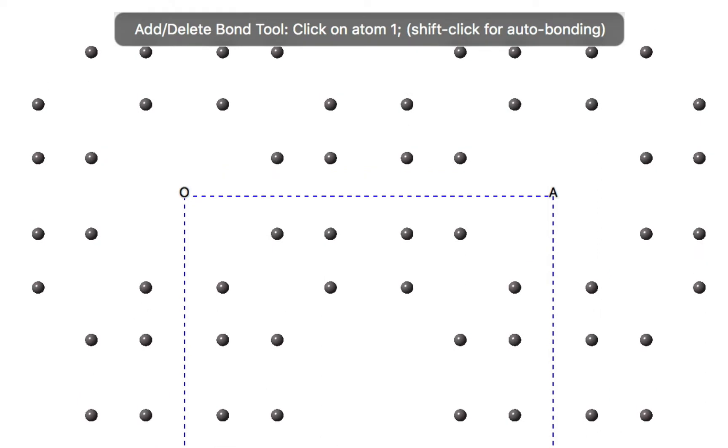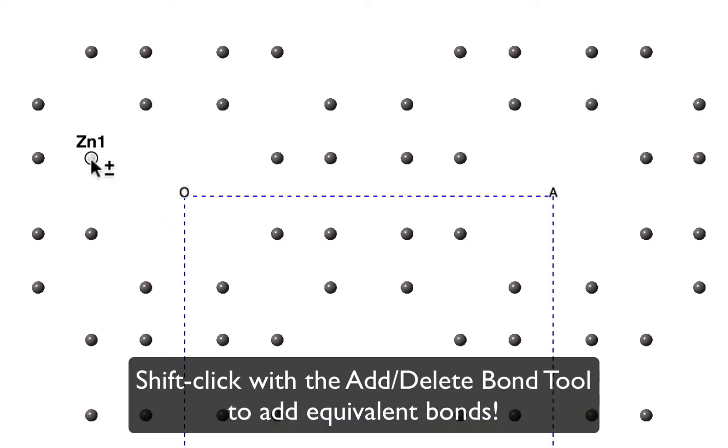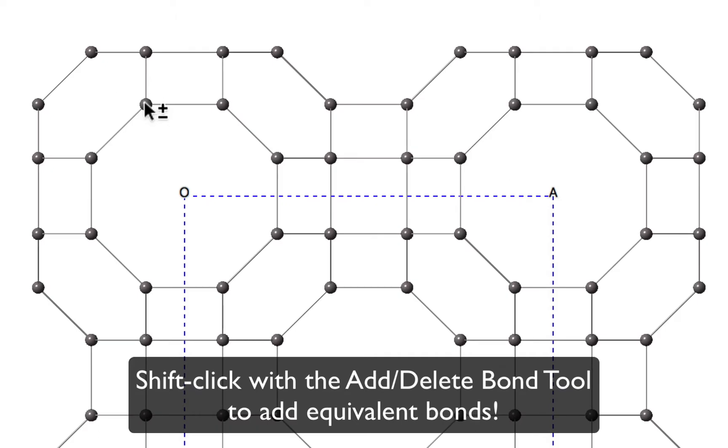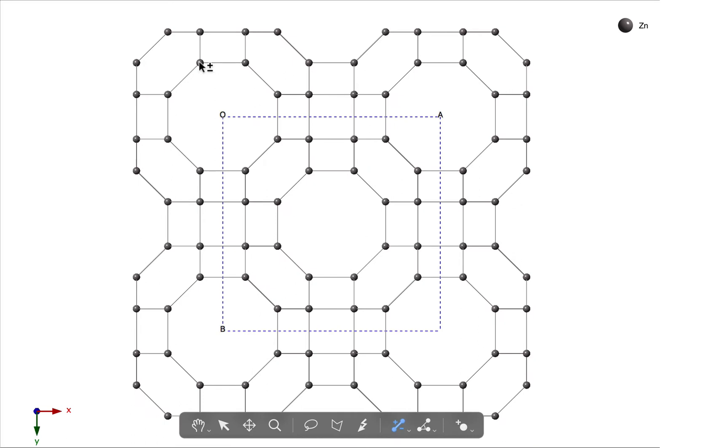We want the add-delete bond tool, and I'm going to click on a pair of zinc atoms. Now I'm going to hold the shift key down as I click, and what that does is it will generate equivalent bonds throughout the structure. So now we have a framework topology.